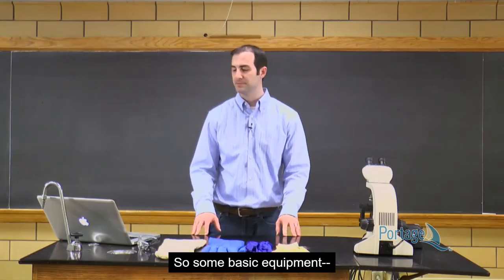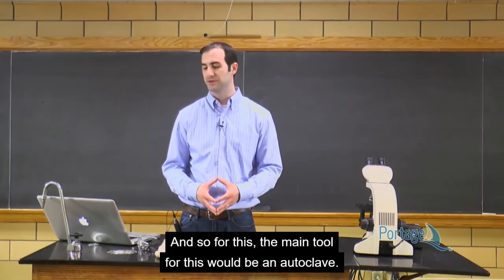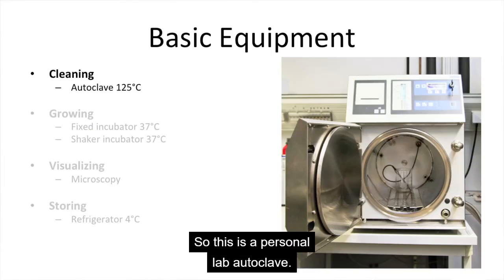So some basic equipment. The first one would be cleaning. We need to work in a sterile environment. We want to keep everyone healthy, and so for this, the main tool would be an autoclave. So the autoclave, you can see, is shown here on the right. They do come in different sizes, so this is a personal lab autoclave.